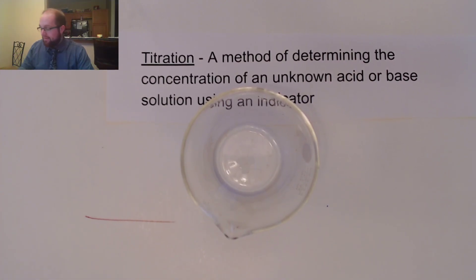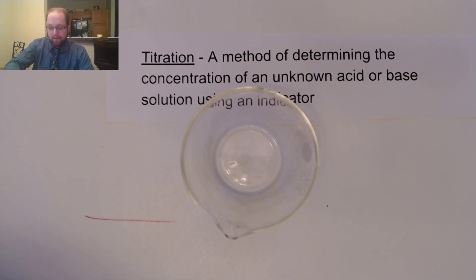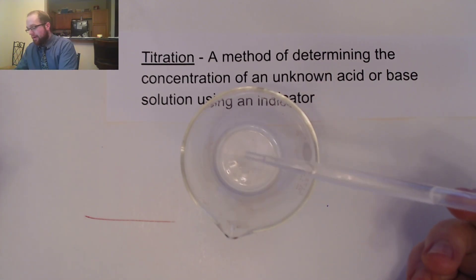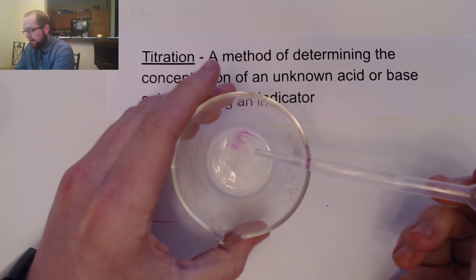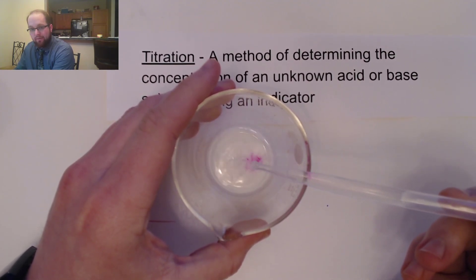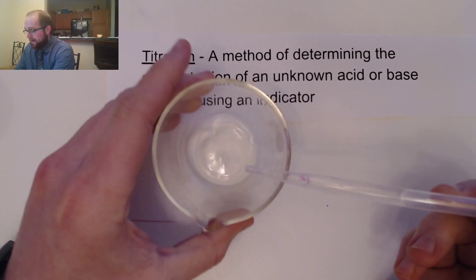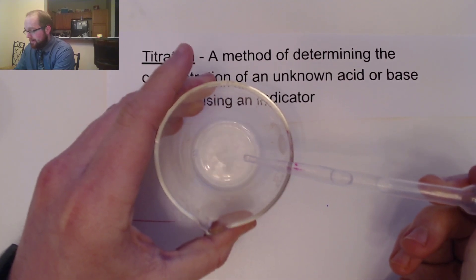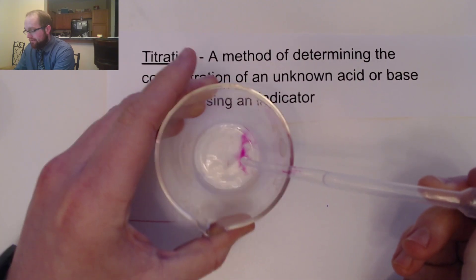The base that I'm going to react this with is some sodium hydroxide. We know that when I place my indicator phenolphthalein into acid, it stays clear. However, as I add base, you will see pink starting to form. As my drop goes down, we see a nice splash of pink — that is that base reacting with the indicator. But then as I swirl it around, the indicator is no longer pink because the acid and the base are neutralizing each other.